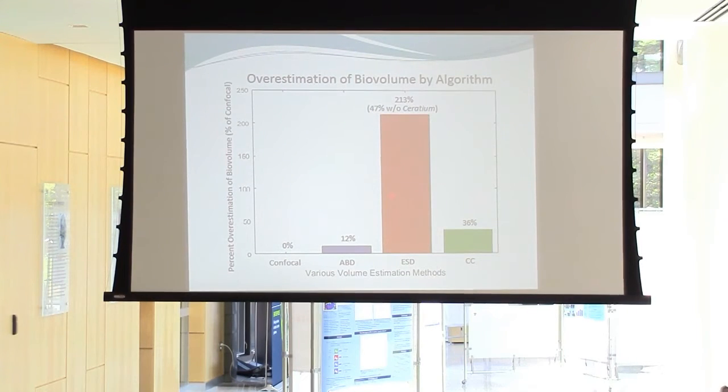The concentric cylinder one is a bit harder to calculate, simply because you do have to use ImageJ and a plugin. However, that one is also fairly easy to calculate, and I would suggest that you use both of them combined in order to get the most accurate result, so that if one of the algorithms goes crazy and gives you a far different exaggeration of the volume, it will reduce your error.